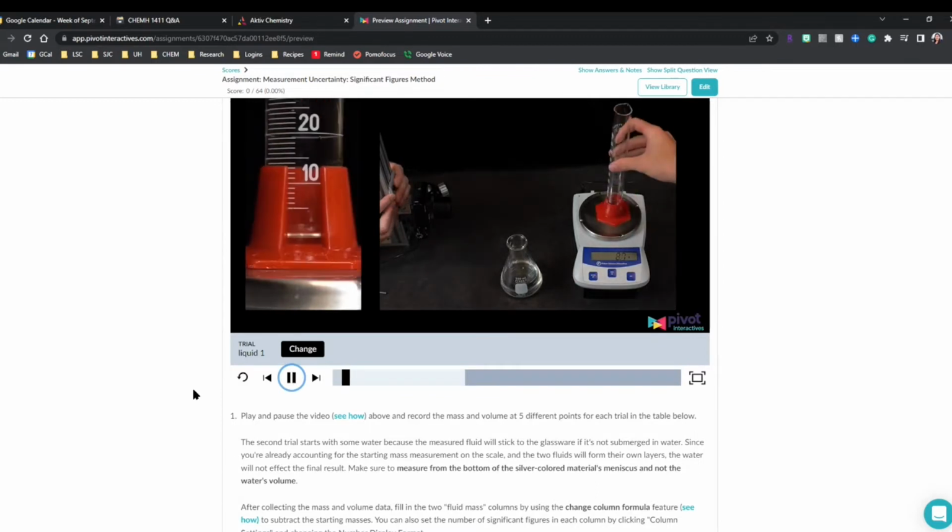It starts off with you placing the graduated cylinder there. Now notice that the graduated cylinder has a mass, right? It's not just weighing nothing. There is a feature on the scale for you to tare it, which means to zero it out once you put that. And that way the mass of your graduated cylinder is not taken into account in the later measurements. It zeroes it out. This is not what was done here because I think this is purposeful so that you learn how to do this. So notice that the graduated cylinder is 96.4 grams. So you can write that down somewhere.